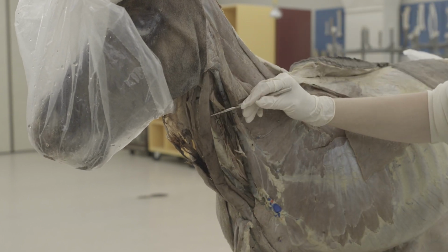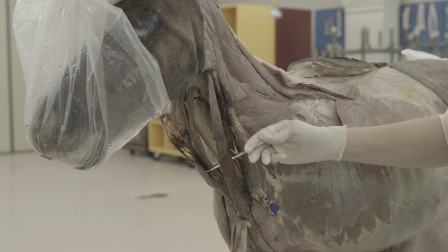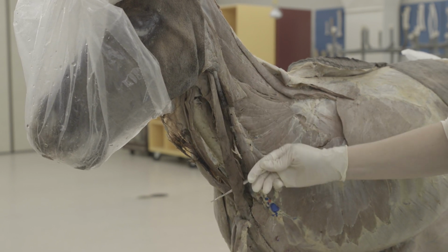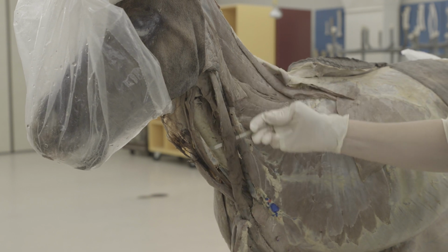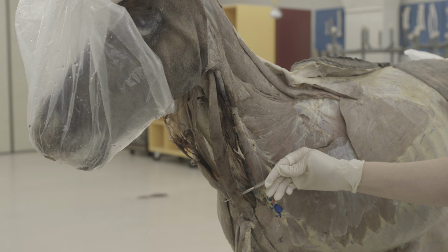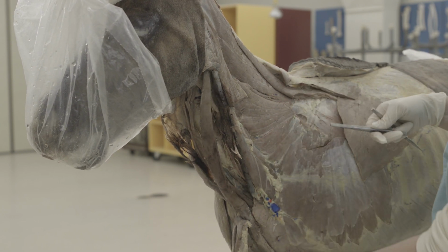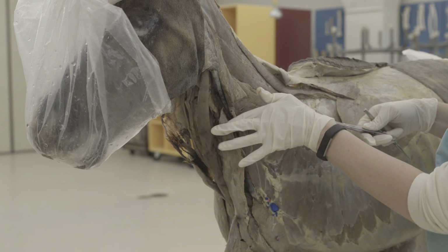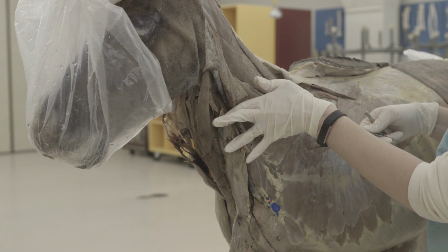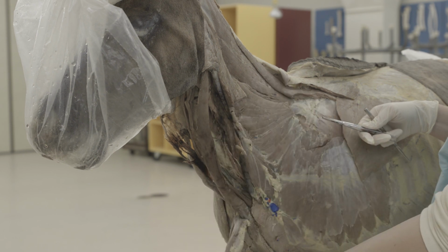Then you have the sternocephalicus muscle. And in the pony, you just have one part, and it's the sternomandibularis portion of it right here. So sternomandibularis and sternocephalicus mean the same thing in the pony, and they're interchangeable terms. If you didn't reflect it, you may have cutaneous colli covering over these muscles, so you'll need to reflect that distally to see those.